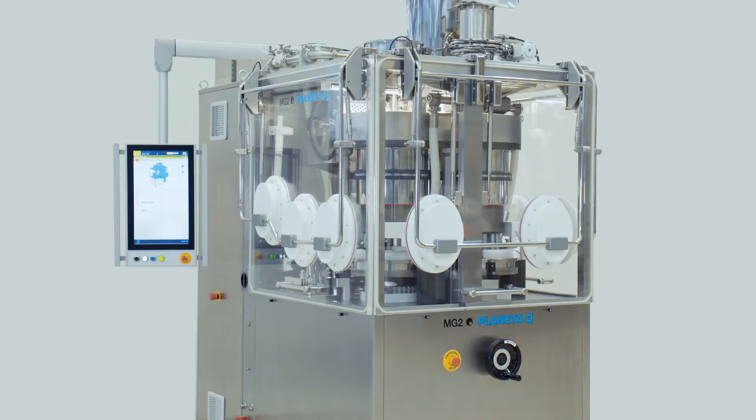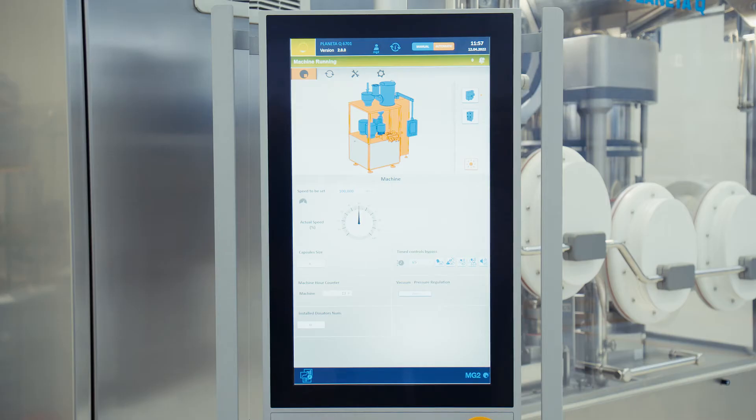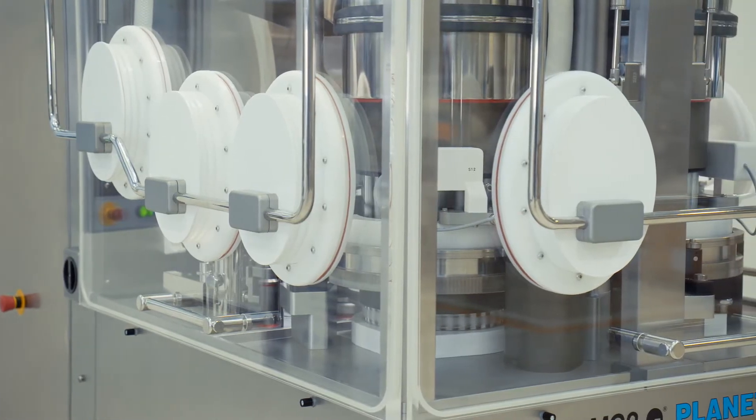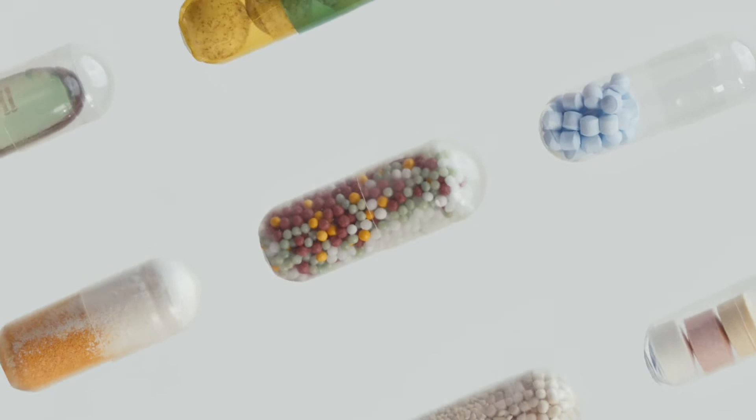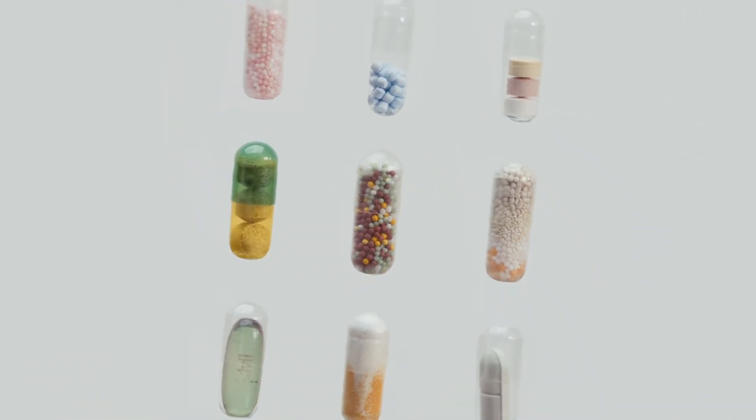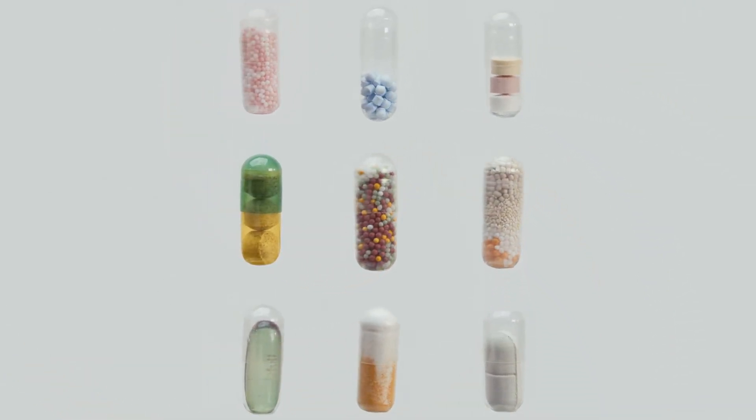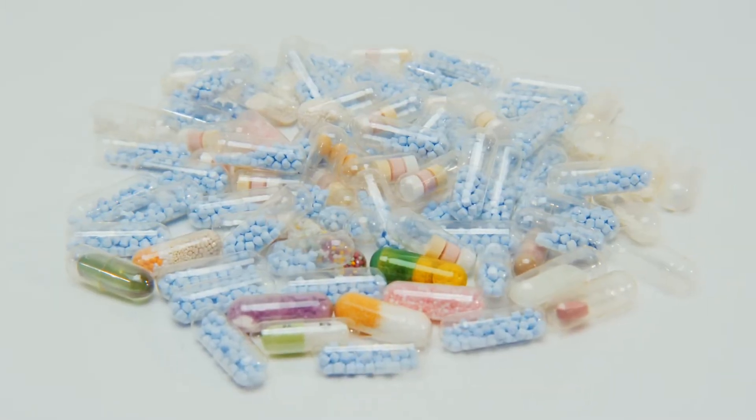Planeta Q focuses on great flexibility in terms of both production speed up to 100,000 capsules per hour and product handling: powder, low dosages for inhalation, pellets, tablets, micro tablets, capsule into capsule, liquid alone or in combination.